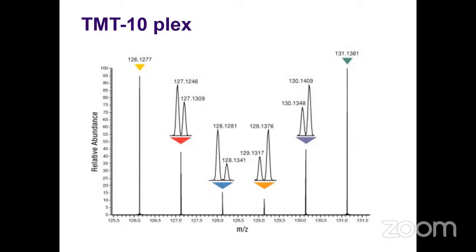And then we have a question on TMT. Is the advantage to TMT saving on runtime? Is that why you combine all the samples, to save on runtime? Are there other advantages as well?